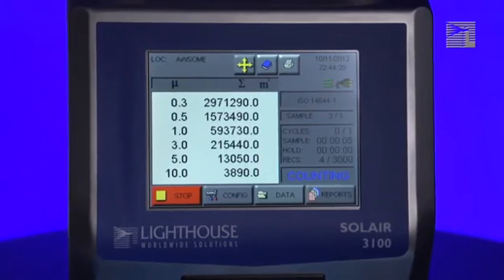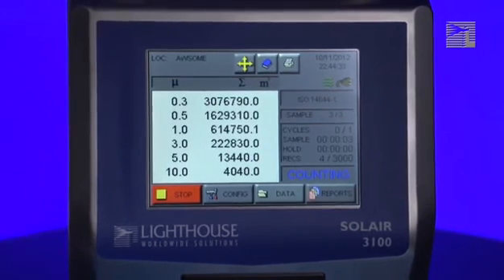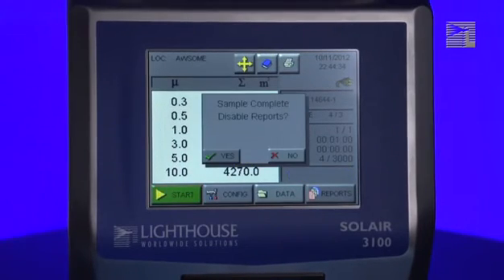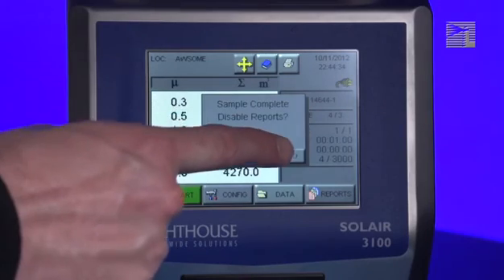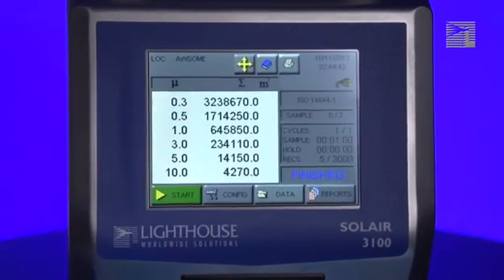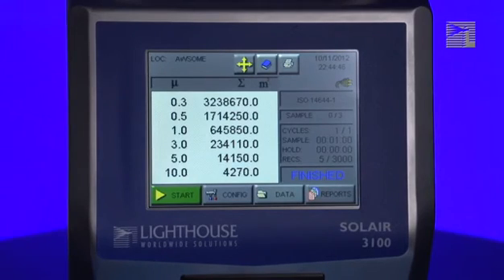Once the instrument has completed the last sample needed for the report, it will display a pop-up message notifying you that the sampling is complete and prompting you whether or not to disable reports. If you plan to run another report after this one, press the No button. Otherwise, press the Yes button.